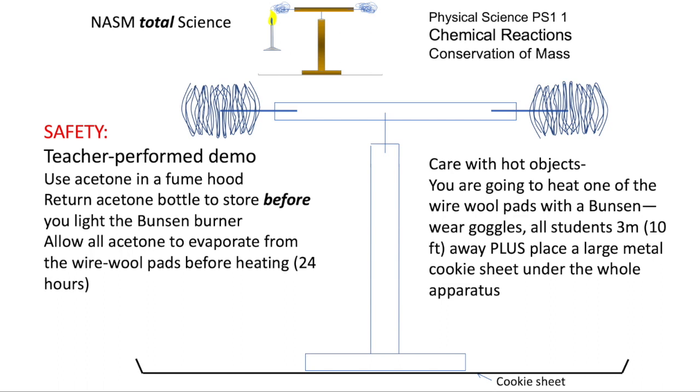And the safety precautions: you're going to wash the wool in acetone and return the bottle to the store before you light a Bunsen burner. But you've also got to do the washing of the wire wool pads 24 hours before you do the experiment and allow that acetone to evaporate. Remember, if we're heating the equipment, it's going to get hot, and students should stay 3 meters away, 10 feet away, and put a cookie sheet under the whole apparatus.